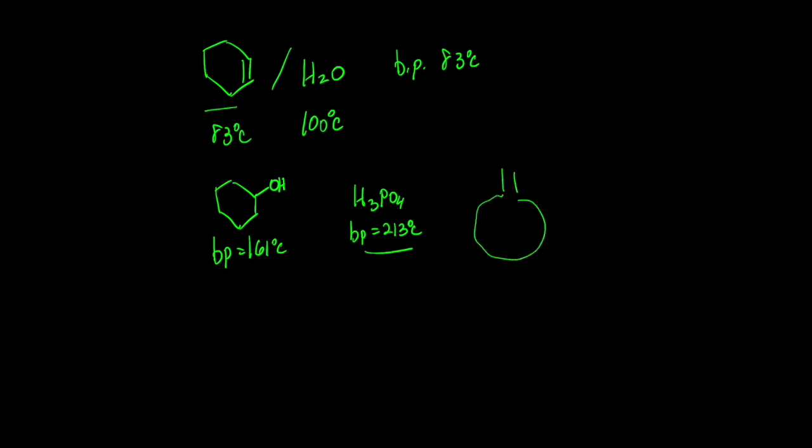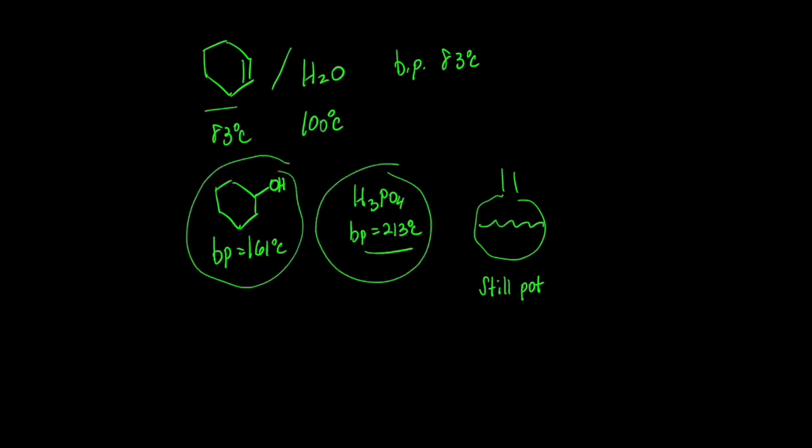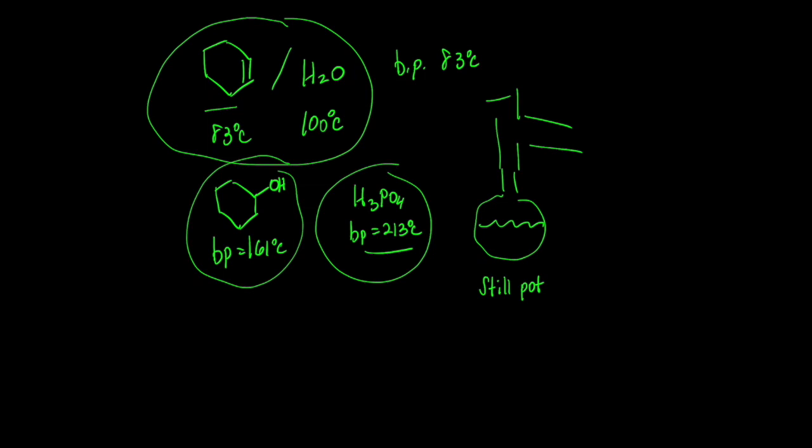So in our still pot of the distillation apparatus, we've got all of these components: cyclohexanol, phosphoric acid, and this stuff here, okay? But when we distill it, and products form, we are going to form cyclohexene and water, which come out, okay, which have low boiling points, okay? And since you're removing product from the product side, the reaction is going to shift to the right. And in here, you have no cyclohexene to push the reaction backwards. So it's a little trick to isolate the product, okay?